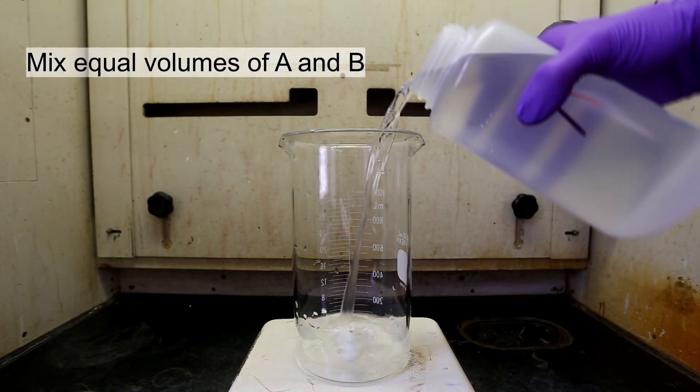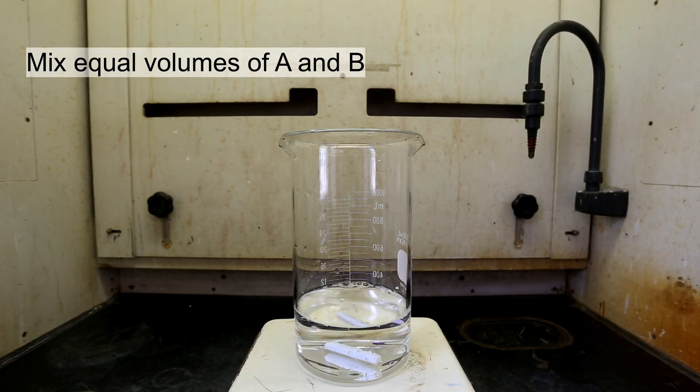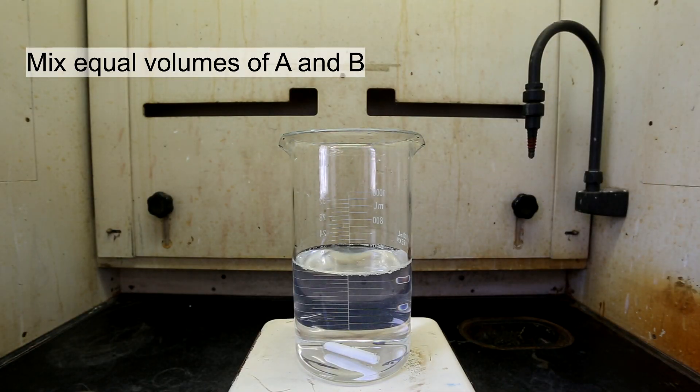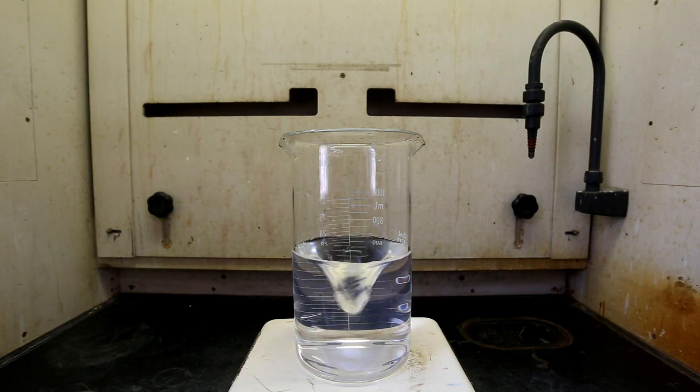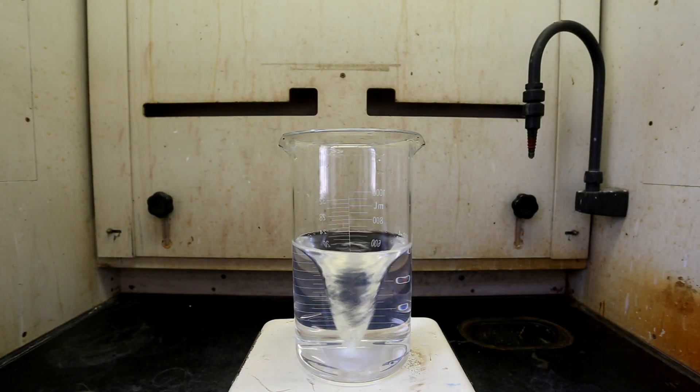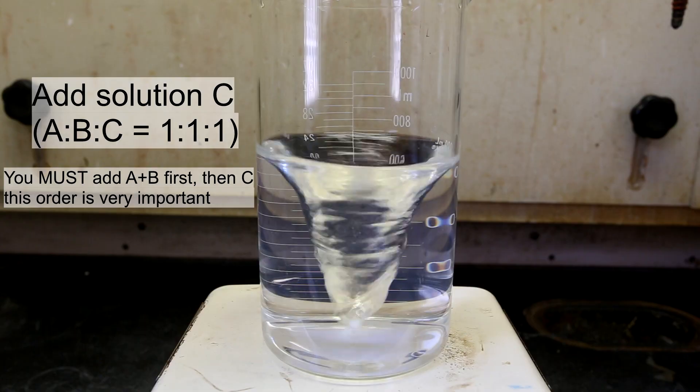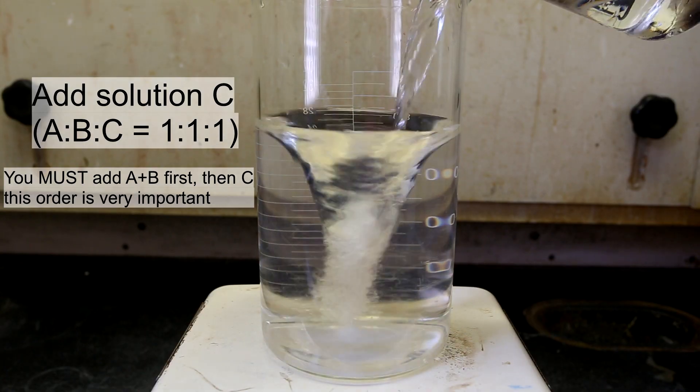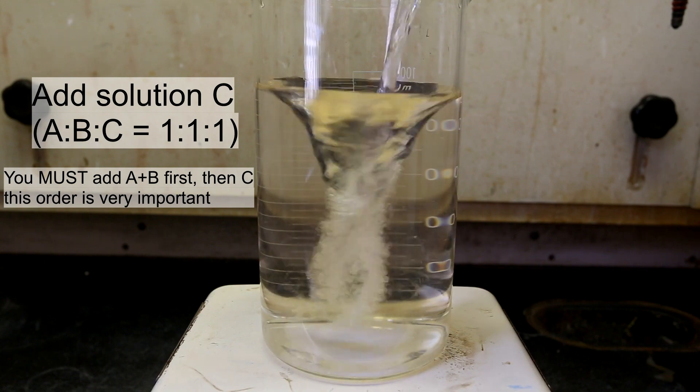First, add equal amounts of solution A and solution B to a beaker. In my case, I opted to use 300 milliliters of each. The solution must be stirred very strongly so that a large vortex appears. Next, 300 milliliters of solution C was added to the mixture. The amounts of each solution added must all be equal.